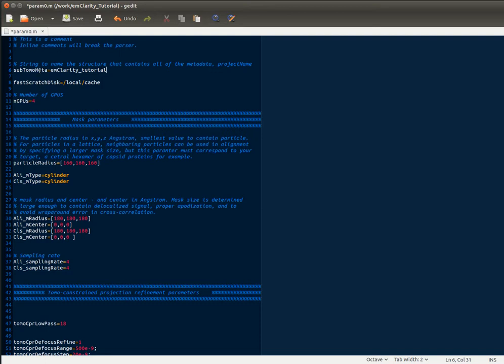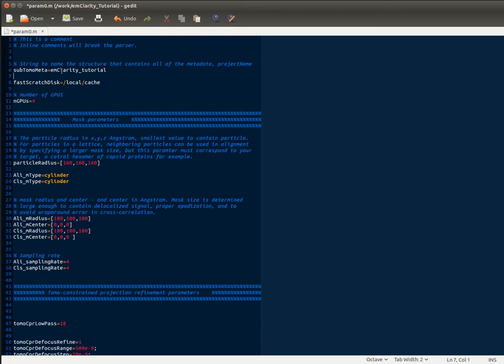Subtomo meta just refers to the metadata about your experiment, and you'll enter a name there. You can change that in the middle of an experiment if you want, and you'll just have to make a copy of the binary file that has a recording of all your data, and that way you can play with different groupings of parameters and compare the results without overwriting anything. So I've called it the EMClarity tutorial here. Importantly, this name can start with a letter and can contain numbers and underscores, but that's it—no other special characters, and it cannot start with a number.